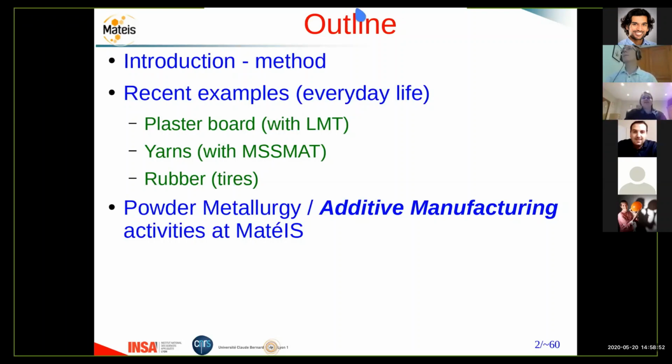Yes, thank you, Eric, for a very nice talk. The question you had from Kostas is a bit similar, and I had asked it before he actually asked it, so this is why it's probably going to be redundant. But in this plaster story, can we really use the tomography or the simulation to optimize the pore distribution? Do you think this would be something really interesting there?